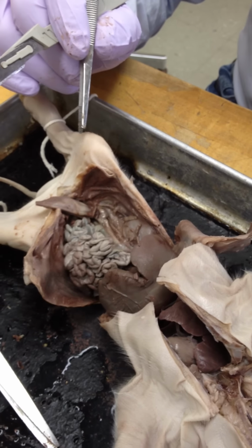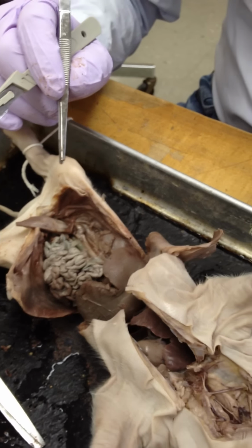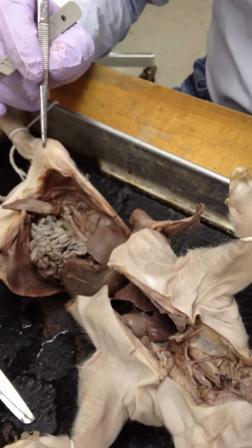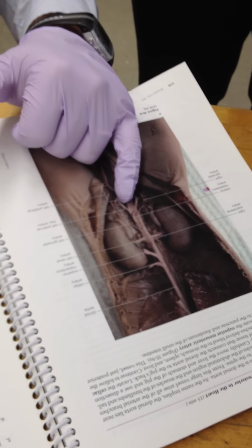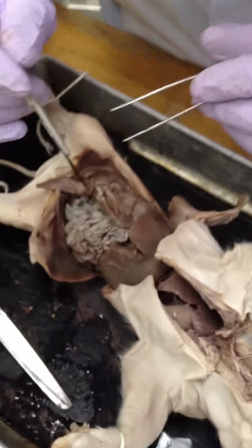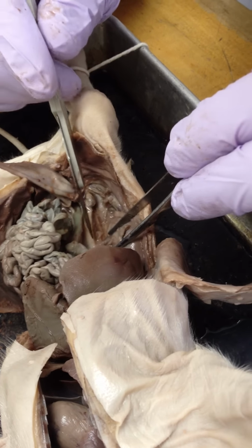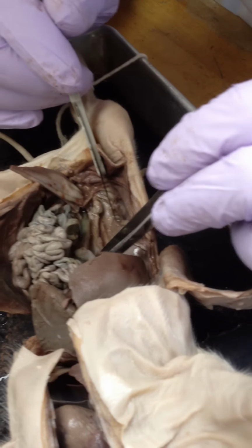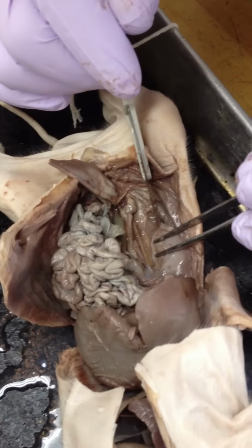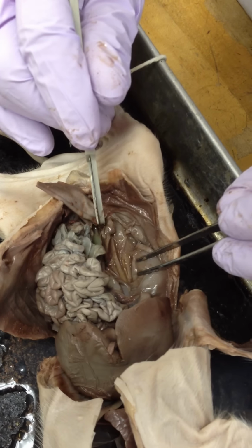I'm wondering if there's a renal... What are you looking for? Renal for the pig? Should be in here, right? Look on the other side of this. So there you go. That's the big, gigantic one, and that's the inferior mesenteric artery. Wow, that is the huge thing here. That's the big mesenteric artery right here. And I think I've messed up. That has to be it.